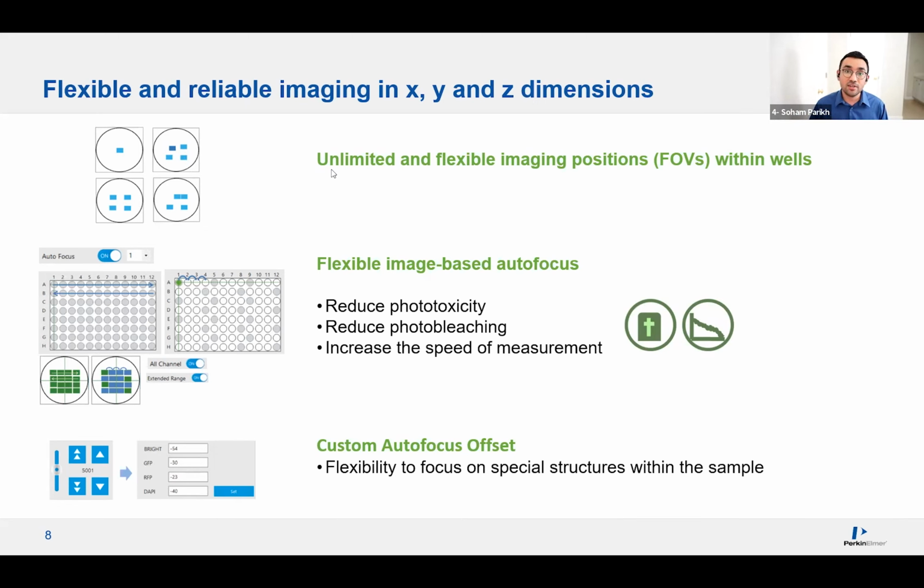When you seed your cells, sometimes they stay in the center, and sometimes some of the cells are more dispersed towards the edges of your wells. To eliminate those sorts of outliers, you can select fields pretty much everywhere in the well and get the confluence readouts from that. That would be more physiologically relevant.